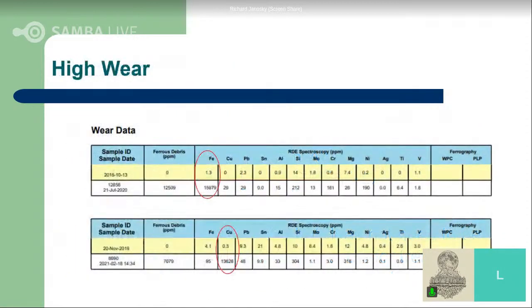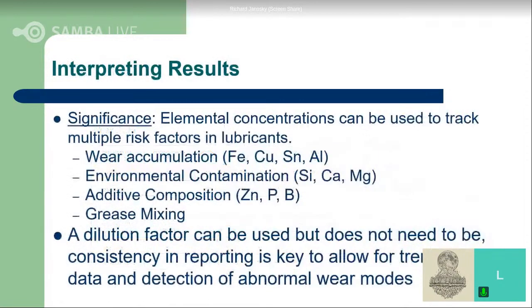So, Richard, if I could just add a couple comments about the dilution factor. I think one important thing we all need to understand and realize here is there is no standard method out here for how to run a grease through a spectrometer. And that's one thing that we're working pretty diligently at ASTM, is to really standardize how to prep a grease and enter a grease into the spectrometer. And that dilution factor can be a debatable issue.